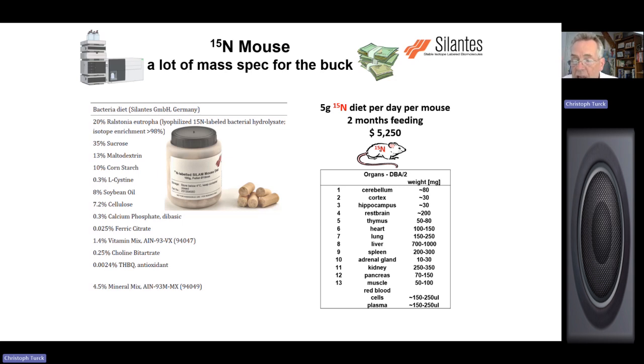And these are pretty decent tissue weight numbers. Look here, cerebellum, 60, 80 milligrams. And here the liver, you have 700, almost a gram of liver. So try to think of how many mass spectrometry experiments you can do with this. And even if you're only interested in the brain, maybe you have a colleague who's interested in the liver, or someone is interested in heart, you could even share these tissues.